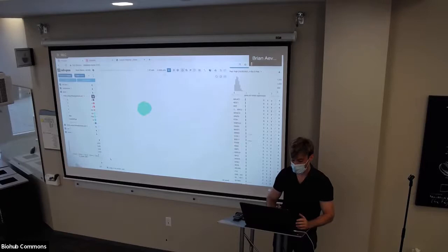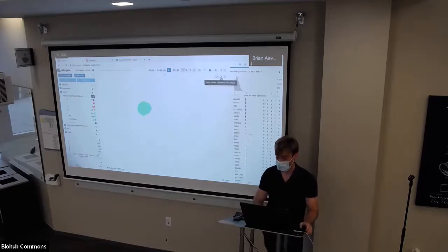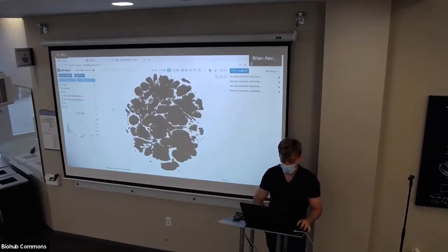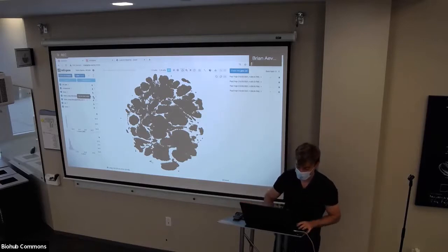But darn, I overwrote the backend and I want to go back to 480,000 cells to look at the global view. That's where this button next to it comes in handy. Reset backend to the full data set. This is when you're done with that particular view and you now want to go back to the full thing. You don't care about lag anymore. So you click that, it resets the page. And now we still have all the stuff we generated from the subsetted data. And this is surprisingly really difficult, to make sure everything stays in sync.